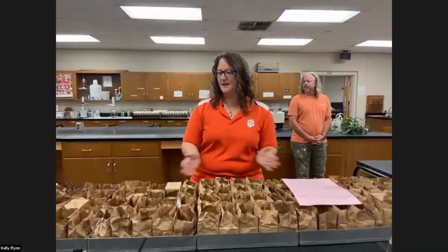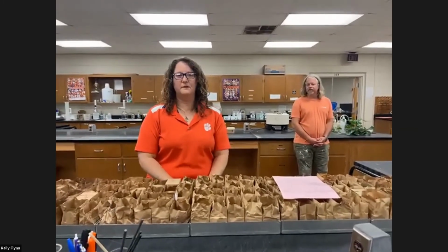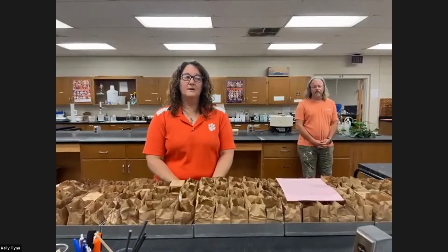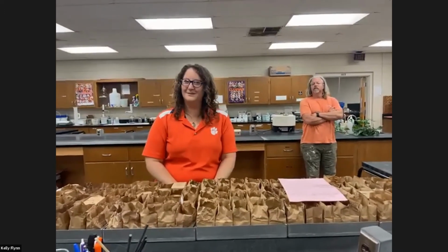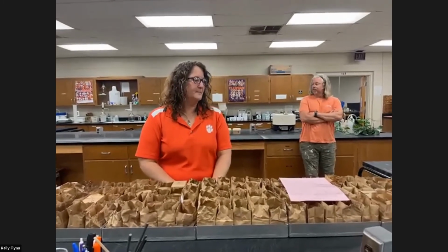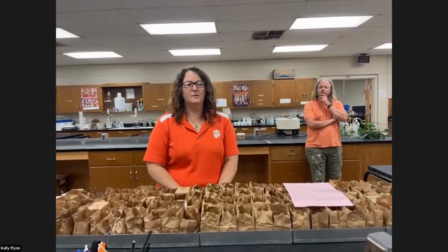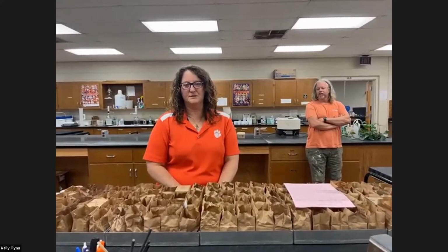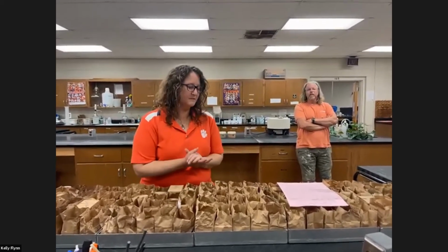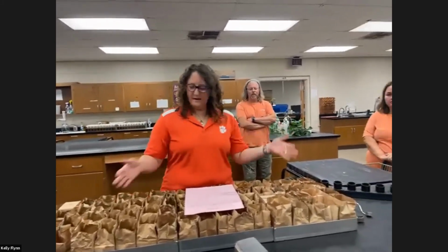But the samples that we're currently working on are here on the lab benches. And so what we're going to tell you about is the 2-part standard soil test that we do for almost every sample that comes through the lab. And we analyze between 40 to 50,000 soil samples annually. So we have a lot of soil samples coming through these lab benches. But right now, Michael mentioned, July is a really quick turnaround time because it's summer. But once we get into fall planting and then getting fields ready for spring, that's when things really kick up around here. But what we do for our 2-part standard test, which I will talk more about later as well, we've got our 100 samples here.